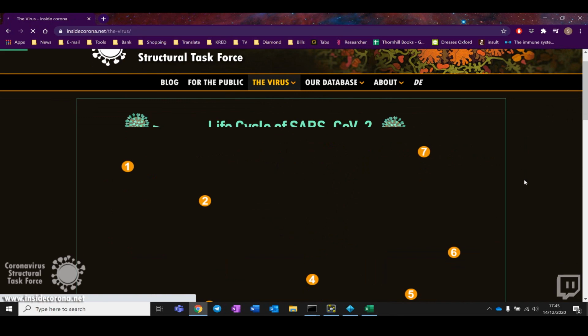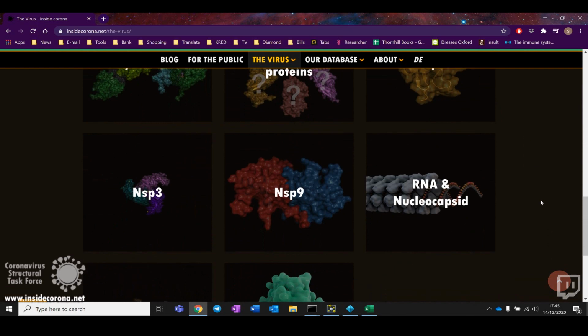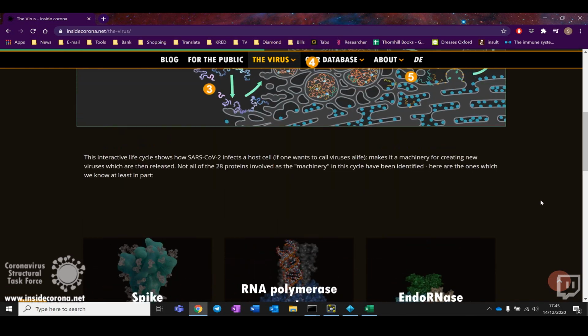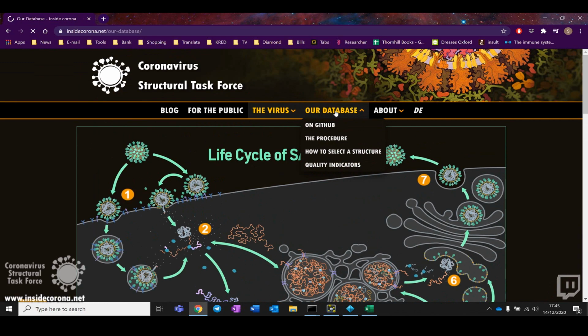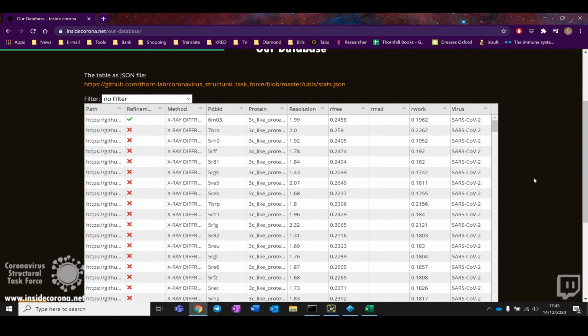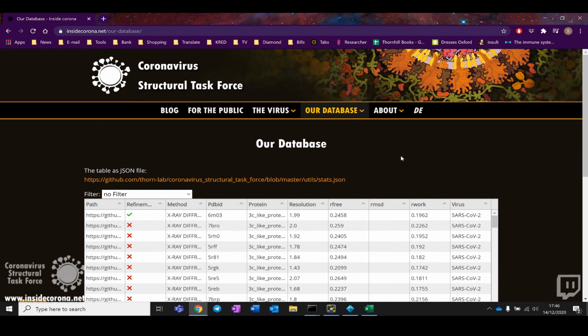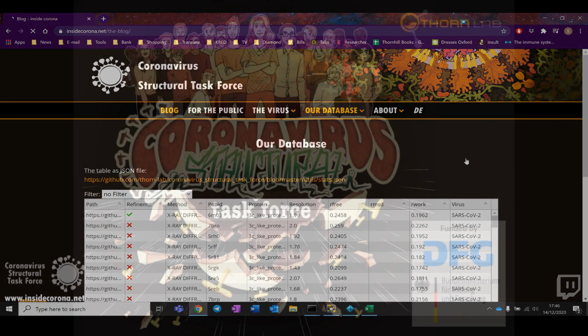We've got lists of all of the proteins that have been solved so far, as well as a resource aimed at people that use structures further downstream to do simulations and try and design drugs, which they then feed to a chemistry lab, which would make the drug, and then the drug would probably come back to structural biologists, where we would again soak that drug back into the protein, see how it binds, and go from there.